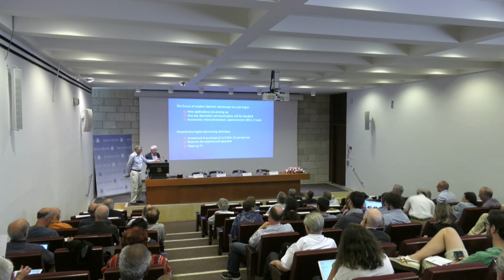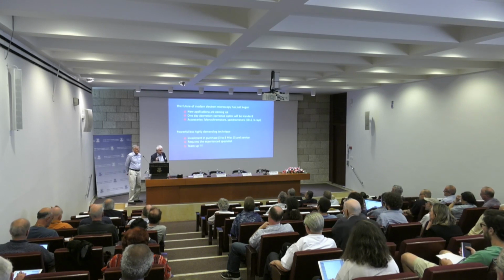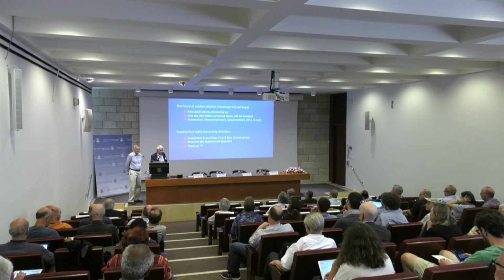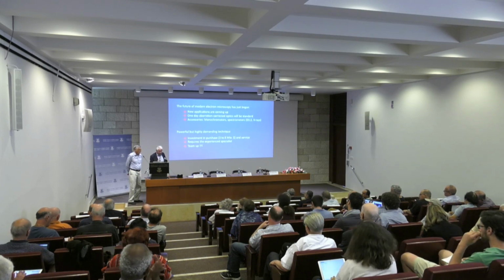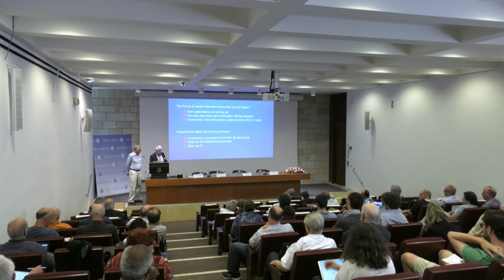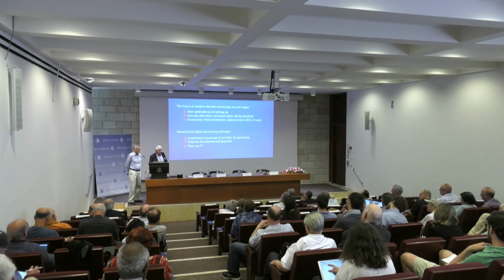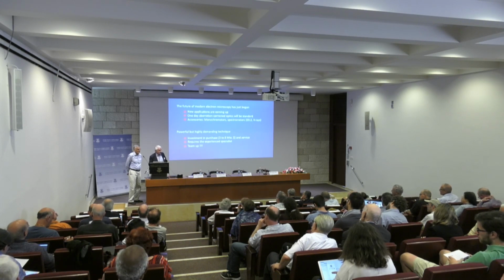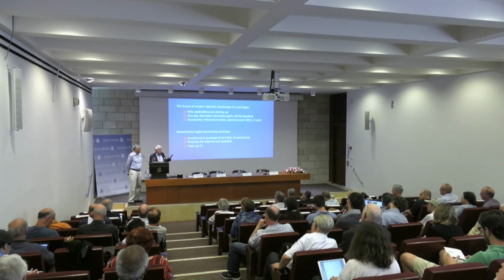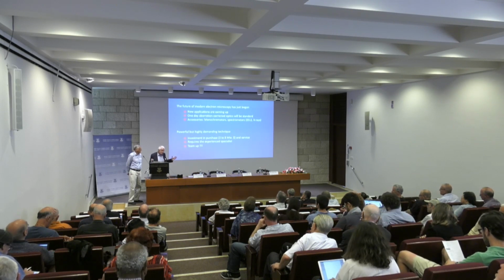I think it is, in principle; it depends on the details. I think in principle it's possible to image these surface layers. That means you can take a gold particle, we had a lecture on this, where you have organic material around that. I think that can be solved. What we cannot easily solve in general is the interaction of the electrons in the beam with this organic coating. Then we immediately have the critical electron doses, which are also important in cryomicroscopy and so on. So, as in many other cases, we do the work with this technique with the samples which are not seriously damaged by the electrons. And the others, we cannot do much with them.